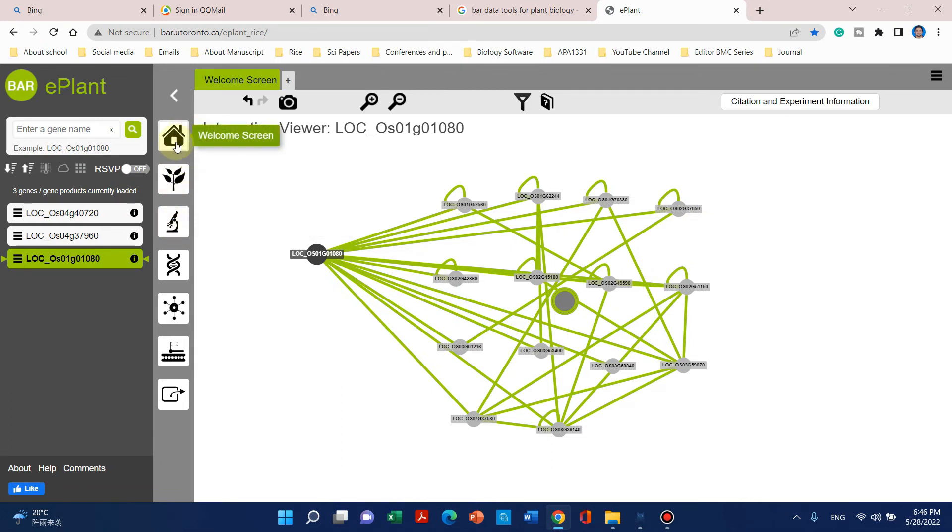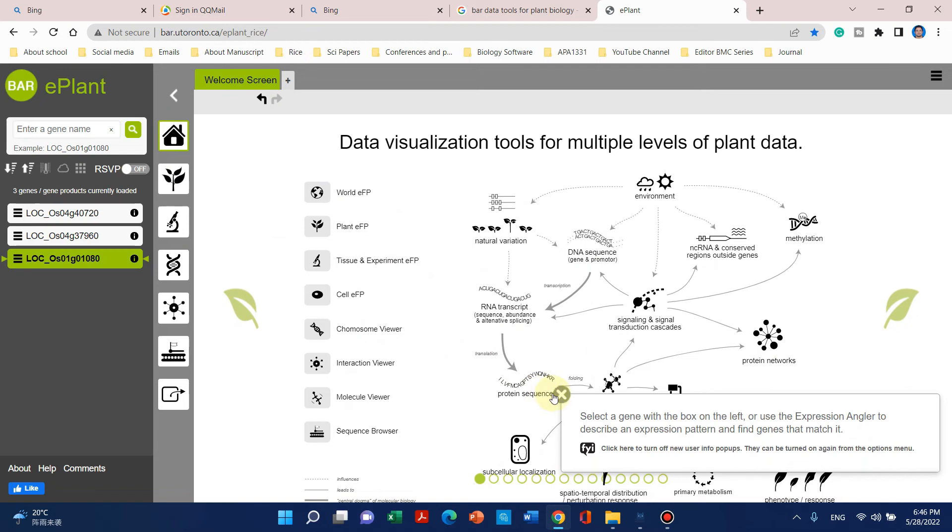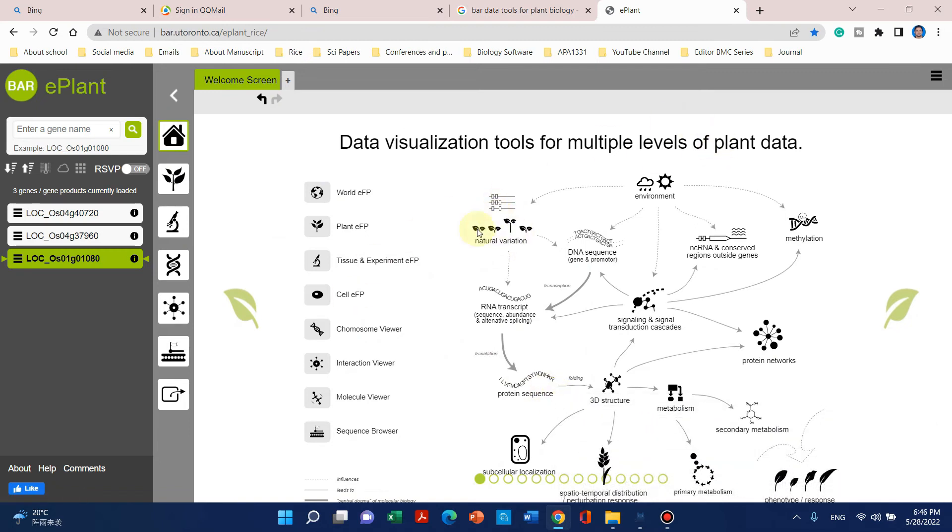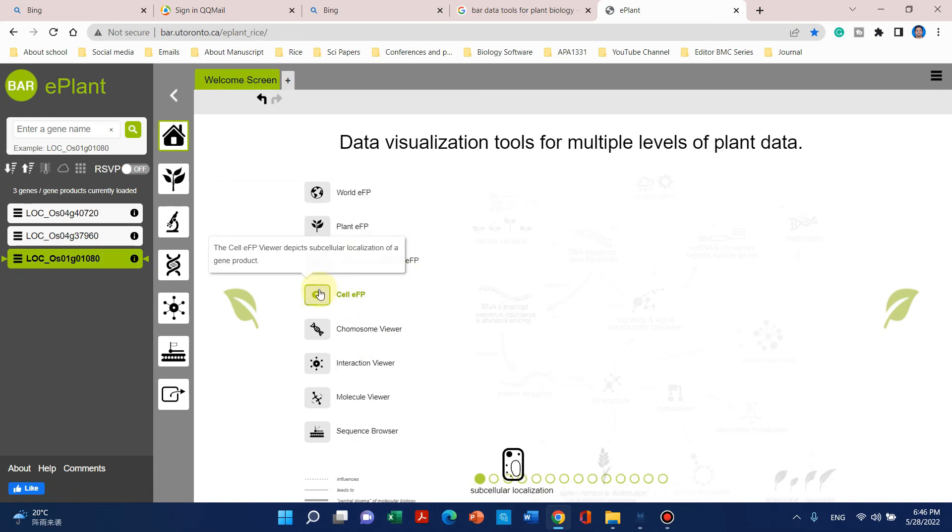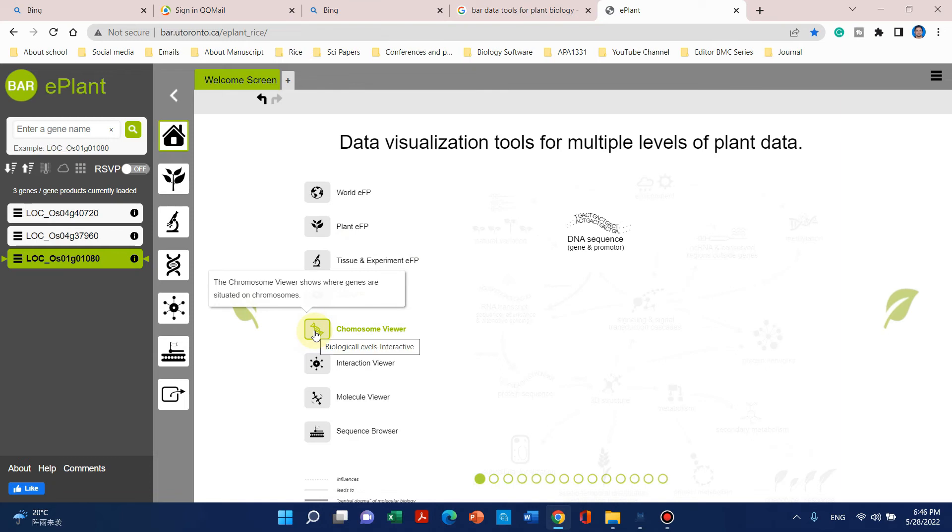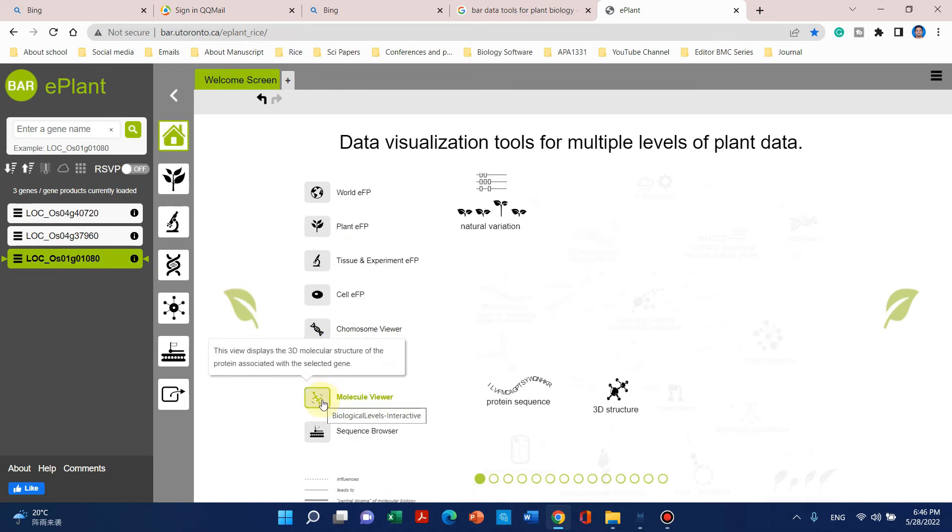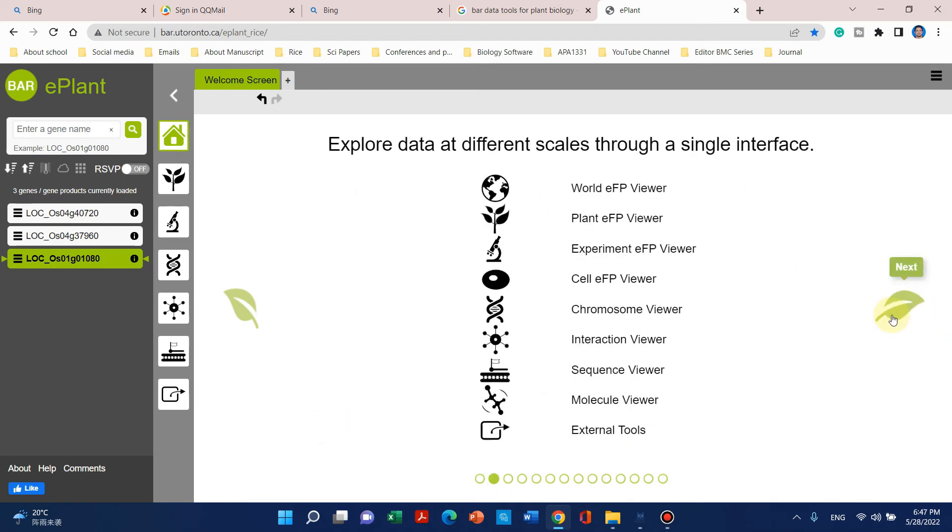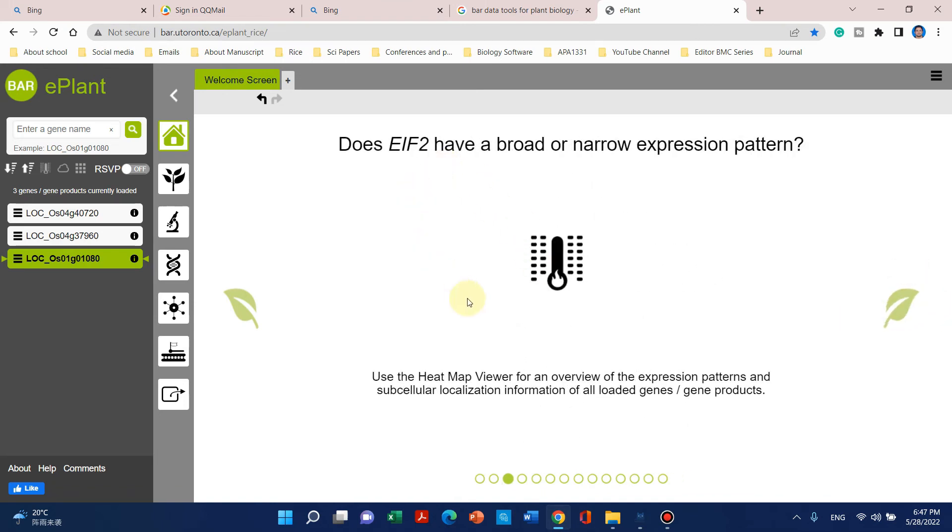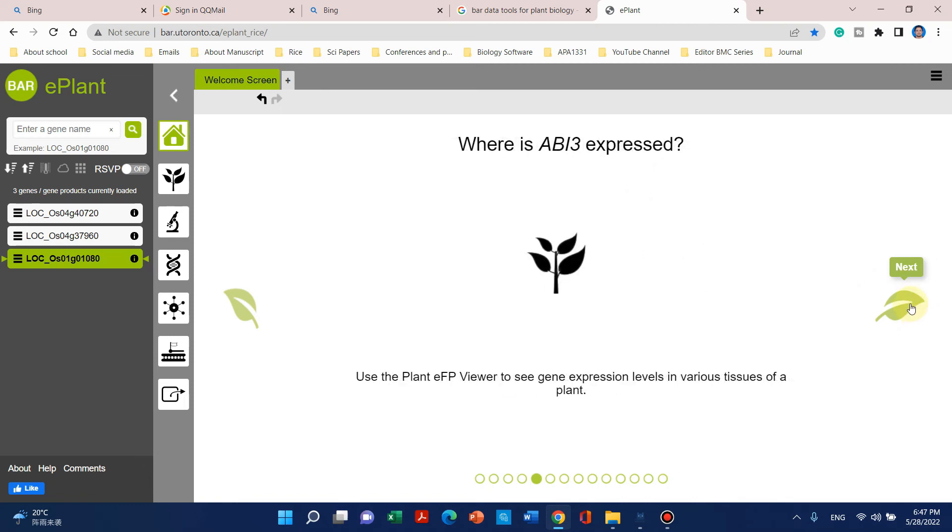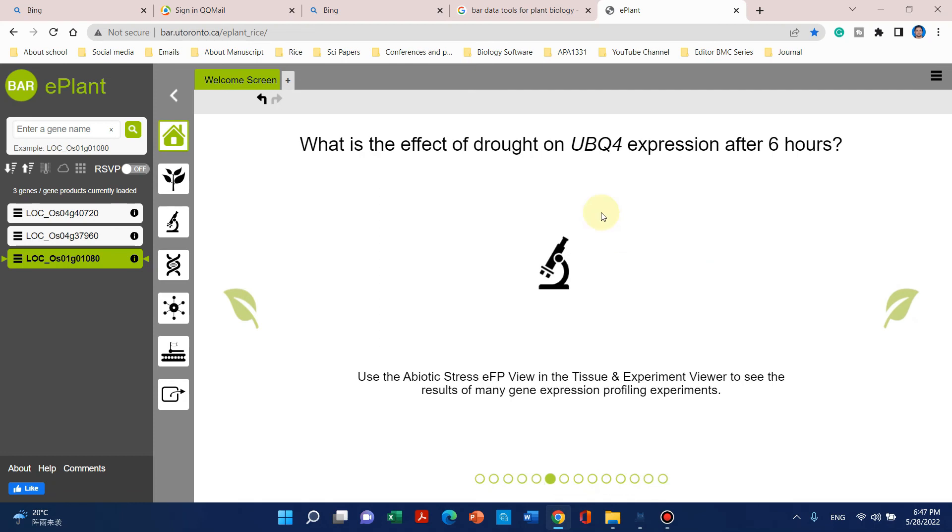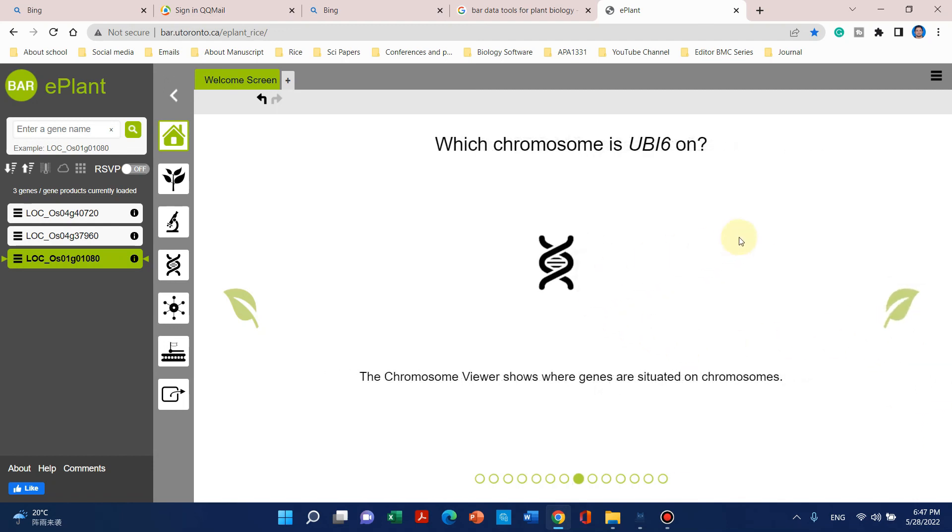Moreover, you can use this ePlant browser to get natural variations, RNA sequencing, tissue experiments, cell experiments, and sequence and interaction data. You can use the heat map viewer and see if this gene has natural variations among different ecotypes around the world. You can see the effect of different treatments on this gene over time and the subcellular localization prediction.